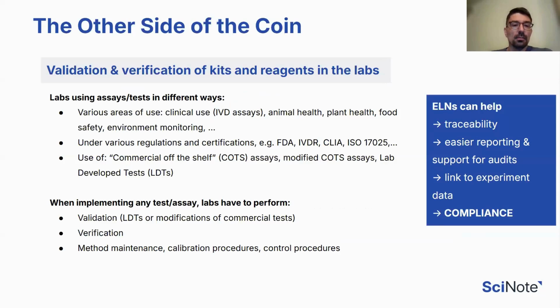So labs use assays and tests in various different ways. So they can be either used in clinical aspects, which in these cases, the assays have to be IVD certified, or that can be animal health, plant health, environmental testing, food safety, and so on. The labs can fall under various regulations and certifications, either by FDA or IVDR, CLIA for clinical labs, ISO 17025, or something even more specific, depending on the domain in which the lab is working.